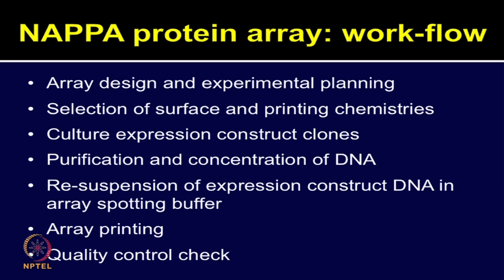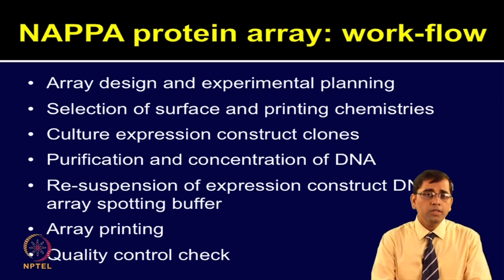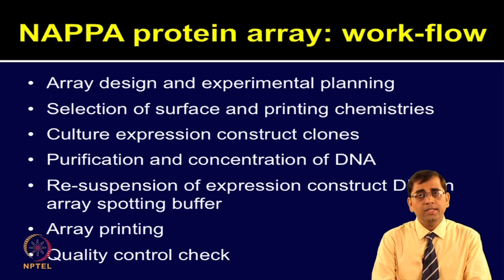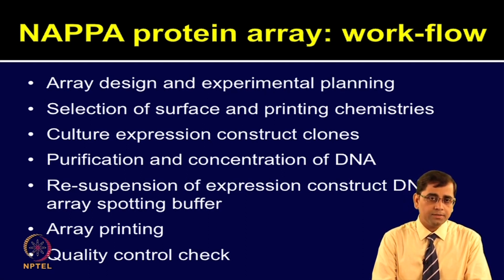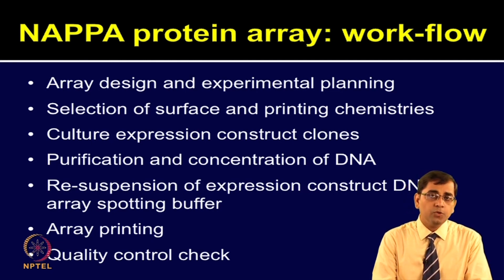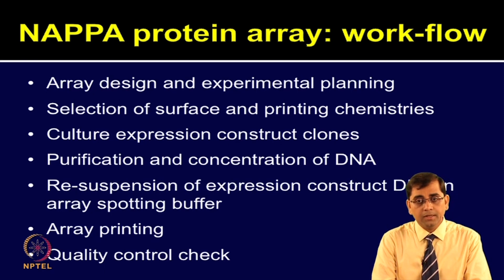Once you have done the culturing of clones, now you need to concentrate on DNA preparation. Almost all the molecular biology laboratories perform these experiments on a routine basis, and it is very straightforward to do the DNA extraction. However, when we talk about doing the experiments in high throughput, it poses several challenges, because the quality of all your features has to be good. So, various types of quality controls and various observations one needs to keep in mind for even simple experiments like DNA purification and concentration.